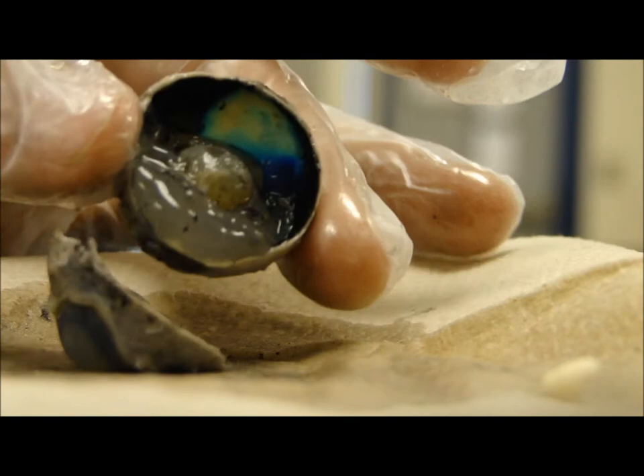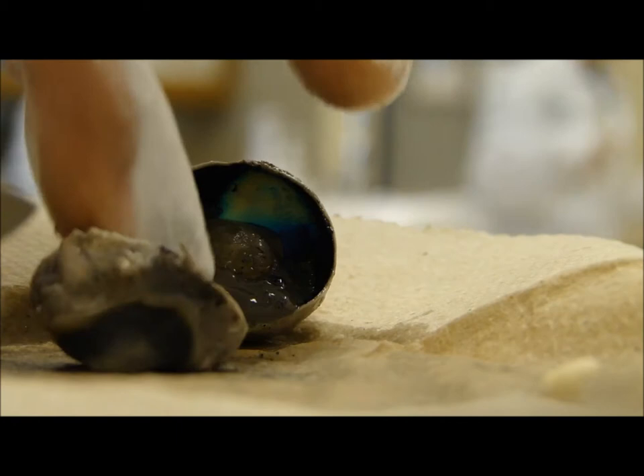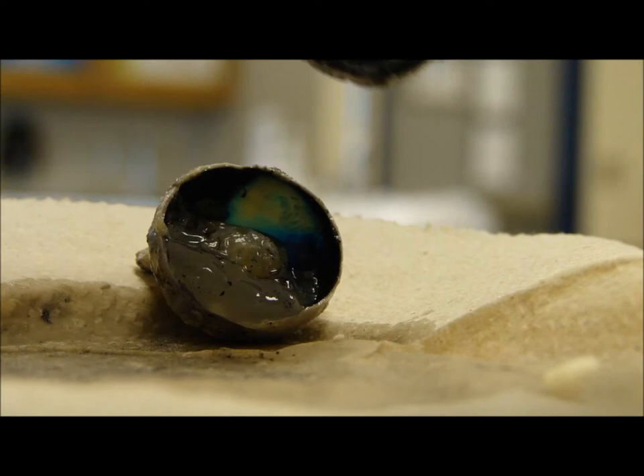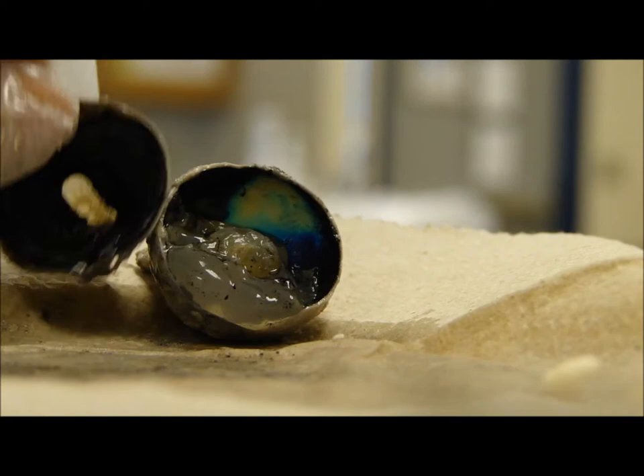It looks like an oyster. Ew, that's so nasty.